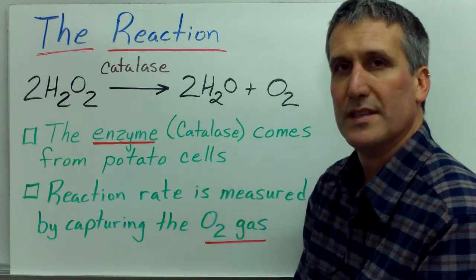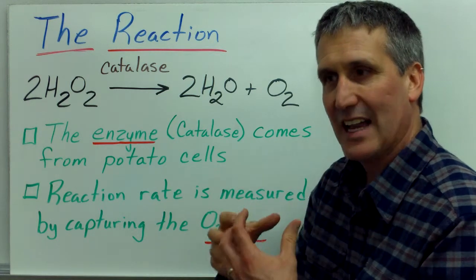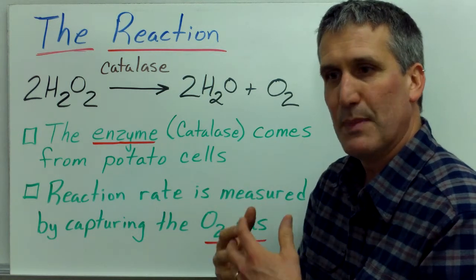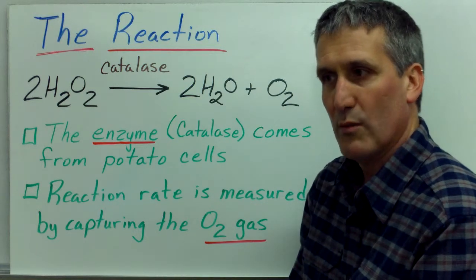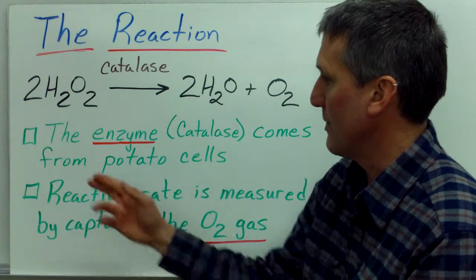We're getting that enzyme by blending potato cells and breaking open the cell membranes. Catalase has been synthesized by those potato cells, and we're releasing them into the water, and we're using an actual enzyme for this experiment.